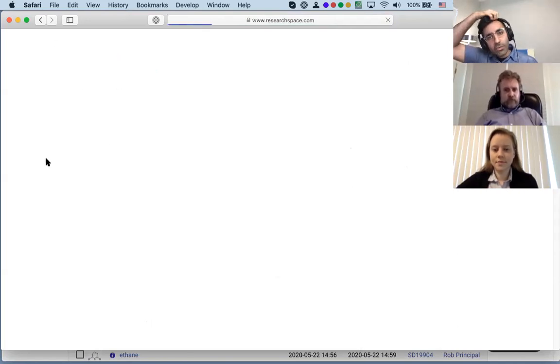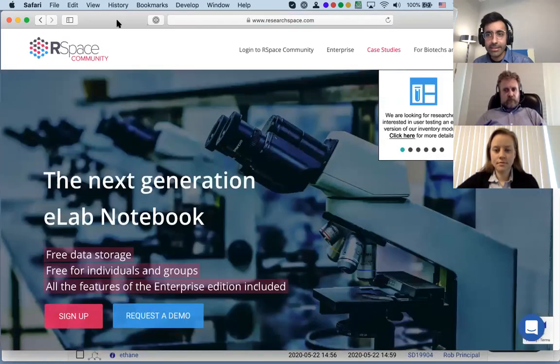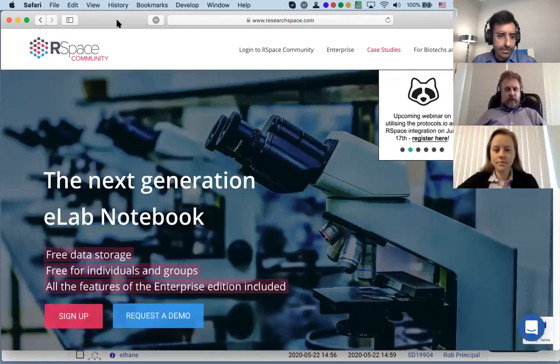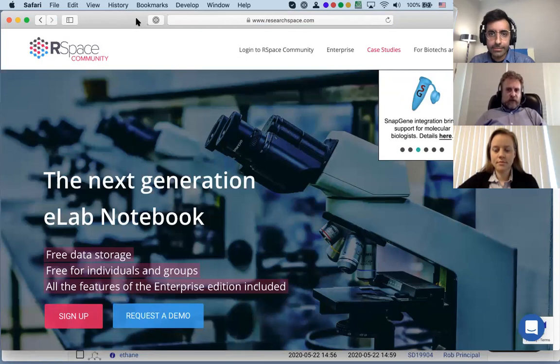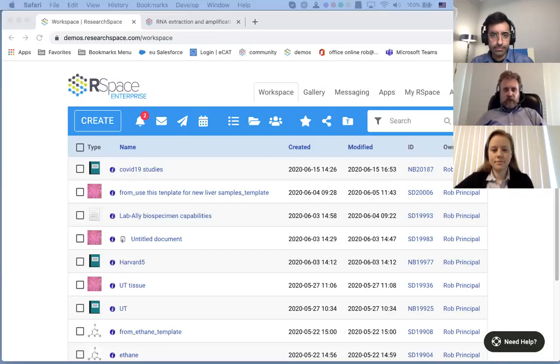Great. And we have one last question, it looks like it's regarding integrations. They ask, could I add Zotero to use instead of Mendeley? That's a great question. We have actually looked at Zotero a couple of times. We don't have it added yet as an integration out of the box. It's absolutely on our roadmap to attempt to add that at some point. If Zotero has an API, which I'm sure it does, you could probably very easily build that integration yourself using our API and theirs. If you have more questions about that, you're welcome to contact us separately and we can talk some more about how that might work.